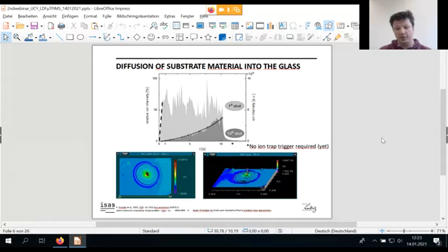And then we were in a little shock, because we realized, okay, if we melt copper, the surface temperature must be very high. I was working with Bien in the lab, and we realized that if the melting point of copper is 1,000 degrees, that surface temperature is maybe too hot to get soft ionization.